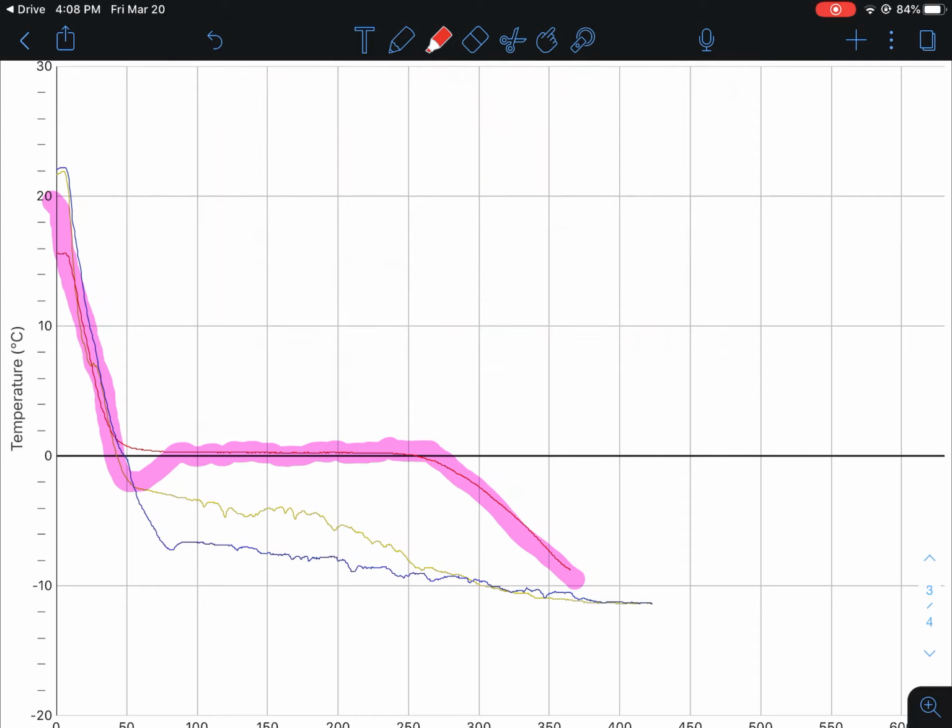We stored that run and did another run, where we warmed that water up, and then it melted, and then it went back up again as it started warming up to room temperature. So if you remember that, you're in pretty good shape to understand this freezing point depression lab. Basically, we are not going to be doing water in this lab.